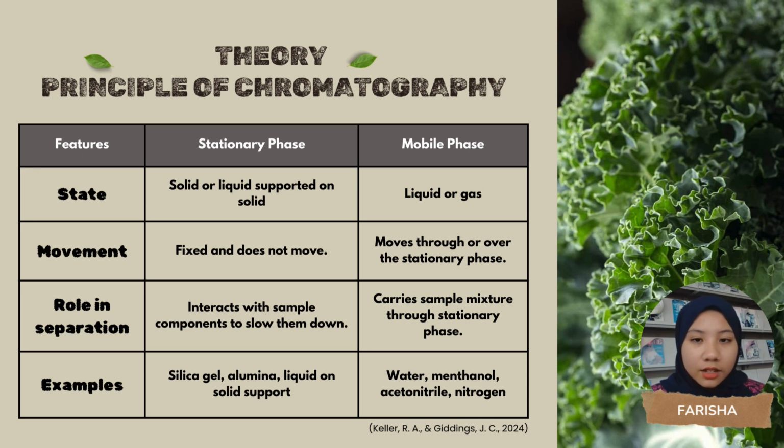The other phase of chromatography is the mobile phase. The mobile phase is the phase that moves through or over the stationary phase. It can be a liquid or a gas. Its primary role is to carry the sample mixture through the stationary phase. The mobile phase interacts with the sample components, helping to transport them along the stationary phase.